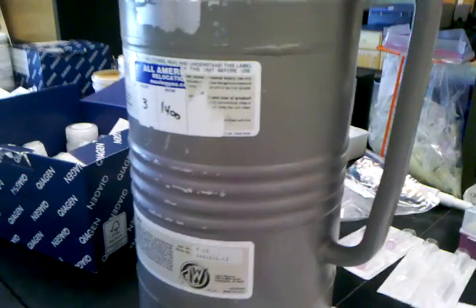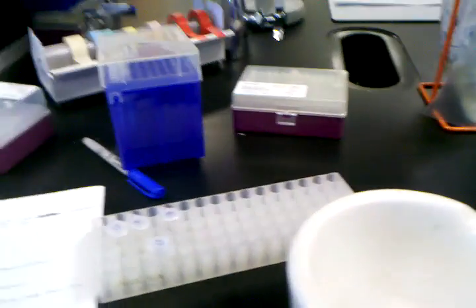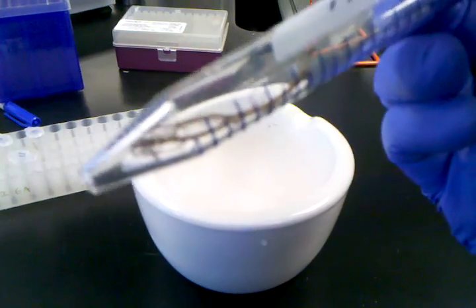Hey folks, today we're going to teach you how to disrupt tissue samples using liquid nitrogen. Get your tissue sample, which in this case is plant roots.